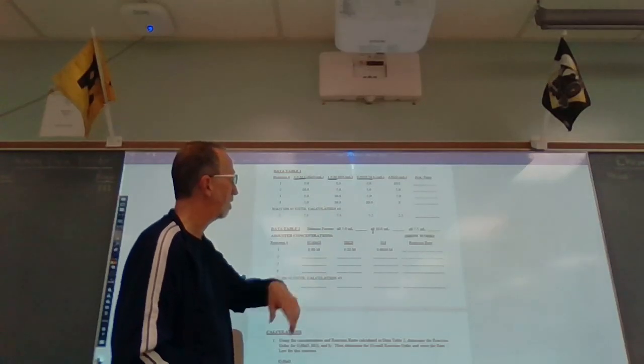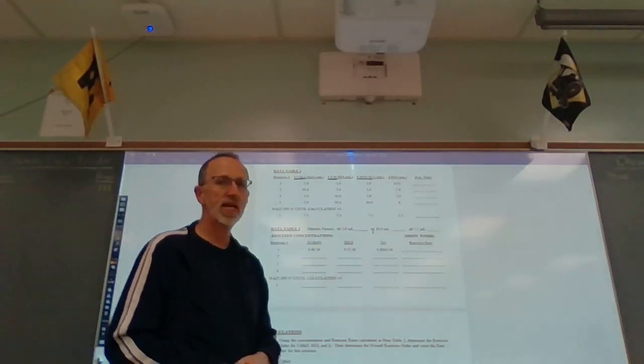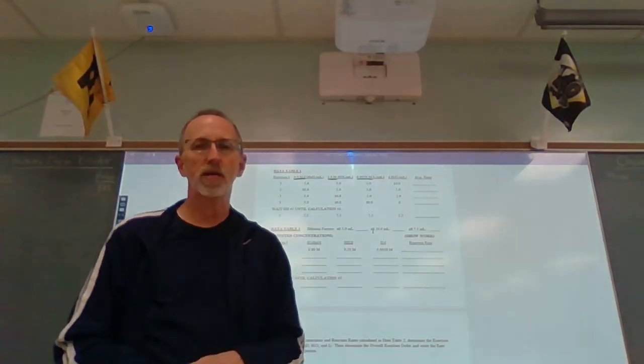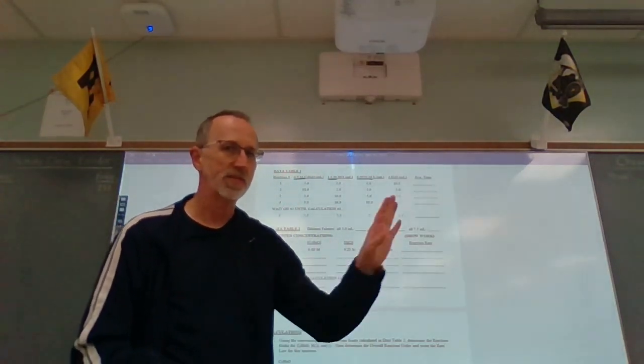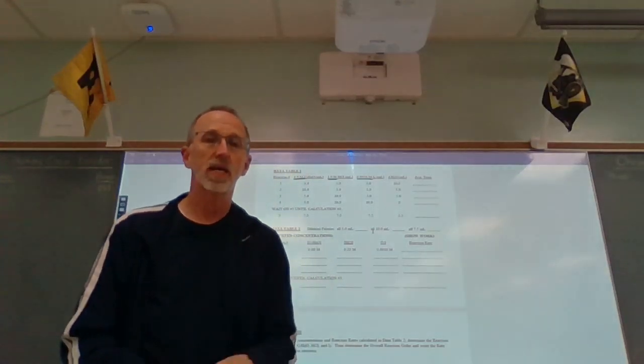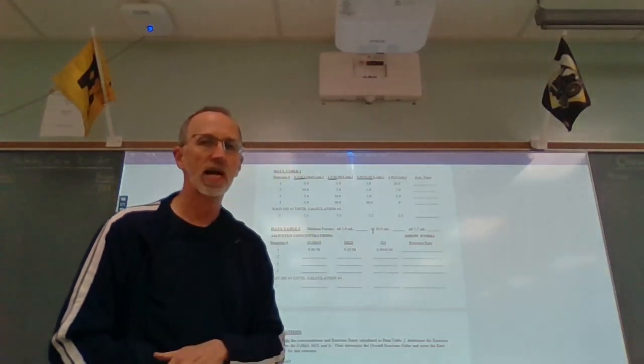We're going up to 10 mLs. We're leaving these 2 the same. That should set off a bell in your mind. Remember, when you're determining a reaction order for a particular reactant, you must keep the concentrations of the other reactants constant so that you can see that the change in the rate is due solely to the change in concentration of the one reactant that you're changing.